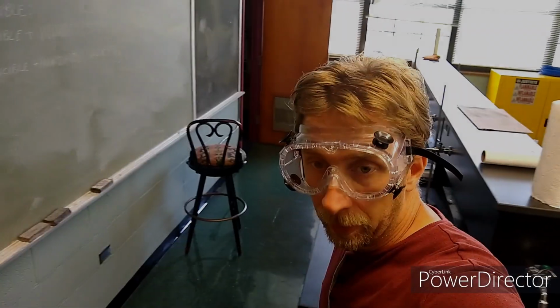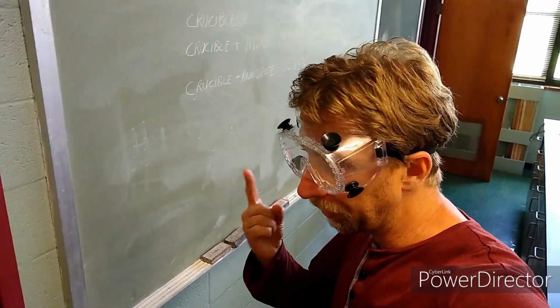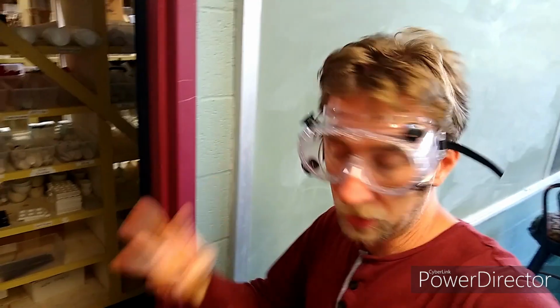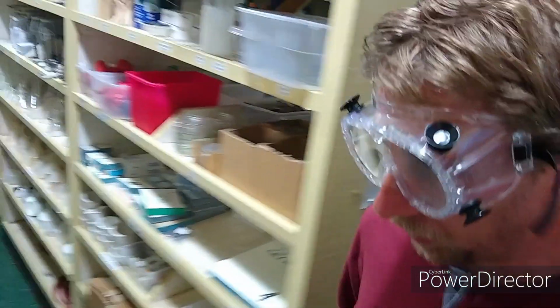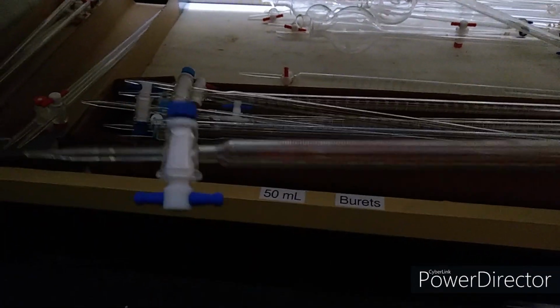Now I got to get a few other things together for the rest of the experiment. Burette, flasks, and magnetic stir bar. I think the burettes are in here somewhere. Here they are. Ah, dropped one on the floor. Don't want to break it. That looks like a pretty good one.